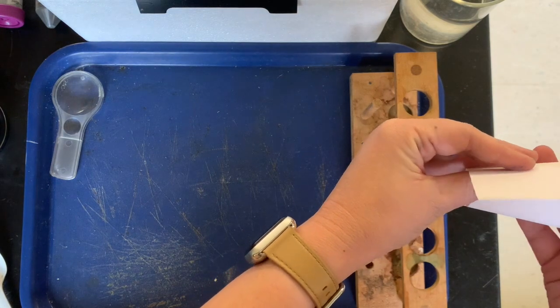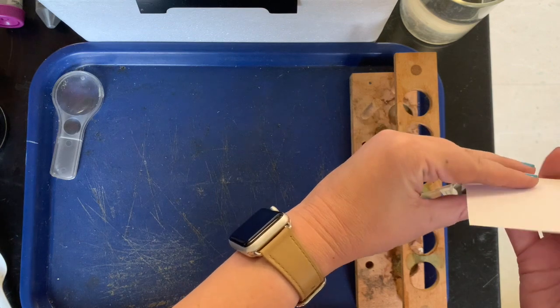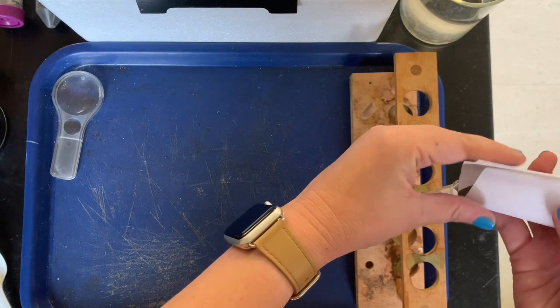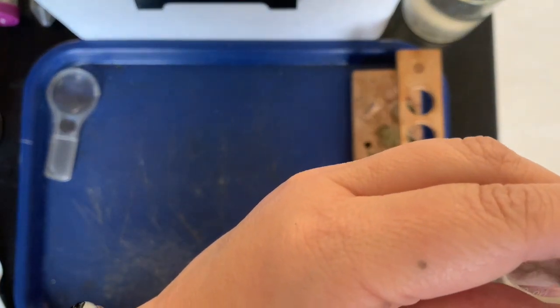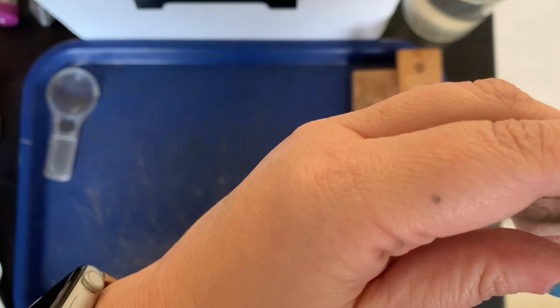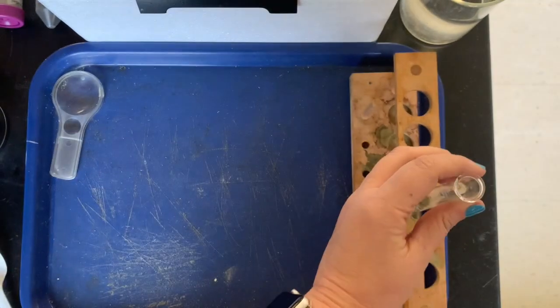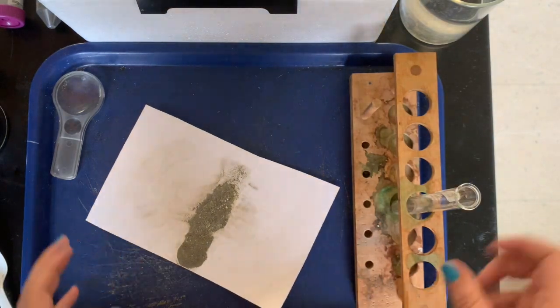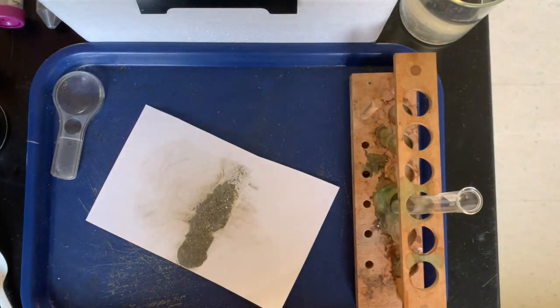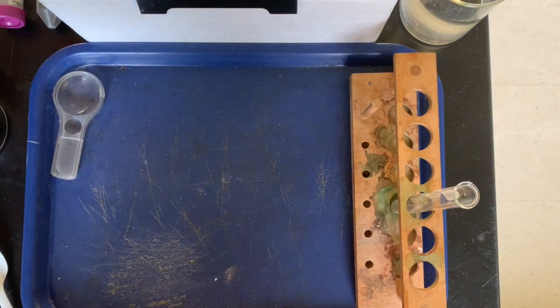We want to fill up the test tube about a fourth of the way. Now I'm feeling nervous when I'm gonna mess up. Okay, I think I'm making it pretty well. I'm just gonna pick it up here. Here we go. Tell me when that's good. Okay, so we've got our mixture in the test tube and we're just gonna set the rest aside. We can maybe do it again later.